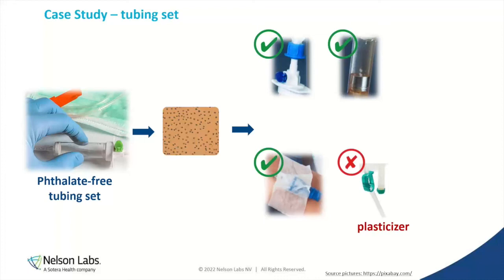So again, this was information that they got from their supplier saying, oh, this is phthalate free. I think it just identified DEHP free, but there was an alternate phthalate used that we were able to pick up. So again, asking those questions, asking the suppliers so that we can get that detail listed. And then we could understand what's the risk to the patient. Is the dose okay? Do we do specific testing? Do they find an alternate component? You can ask more questions to get to a solution after that.